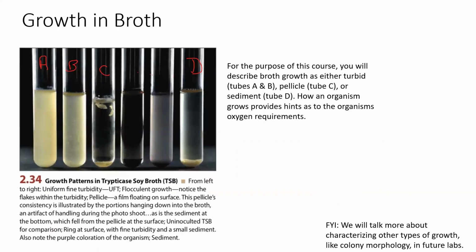Now, when we look at broth cultures, for some reason, whenever people take broth cultures out of an incubator, they automatically want to not shake them hardcore, but shake them a little bit so they can see some of the growth, see things swirling around. It is pretty cool. Can't entirely blame them for that, but you don't want to do that because organisms grow differently in broth, partially dependent on their oxygen requirements as well.